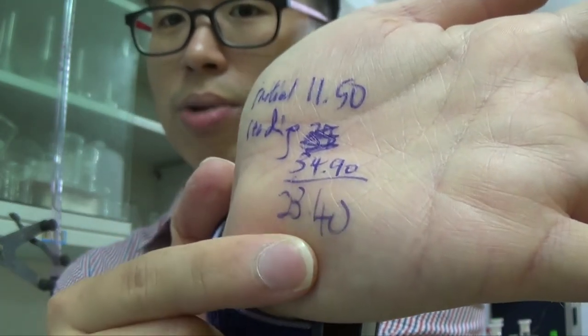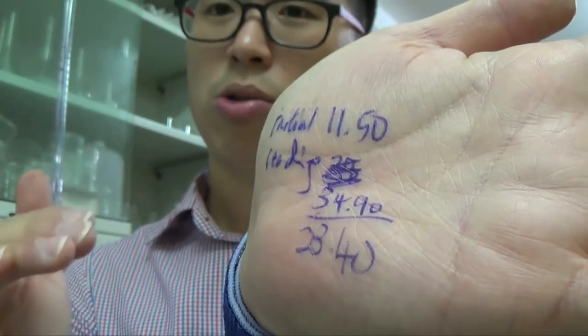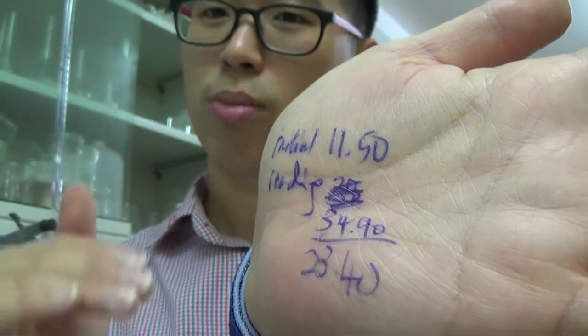23.40 plus minus 0.1 would mean between 23.30 to 23.50. That should have been acceptable for a second or third accurate titration, that you would then put a tick on and average the results to get the average best titer.